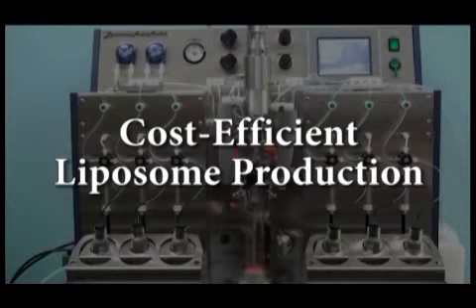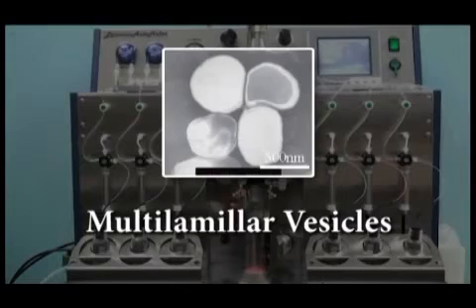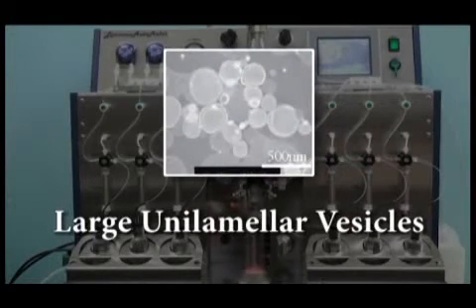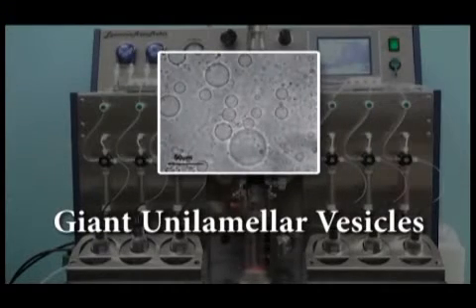The automaker automatically prepares multilamellar vesicles, large unilamellar vesicles, and giant unilamellar vesicles.